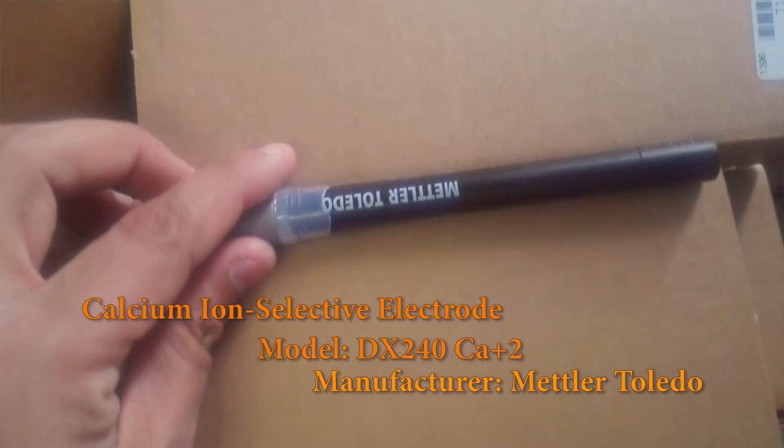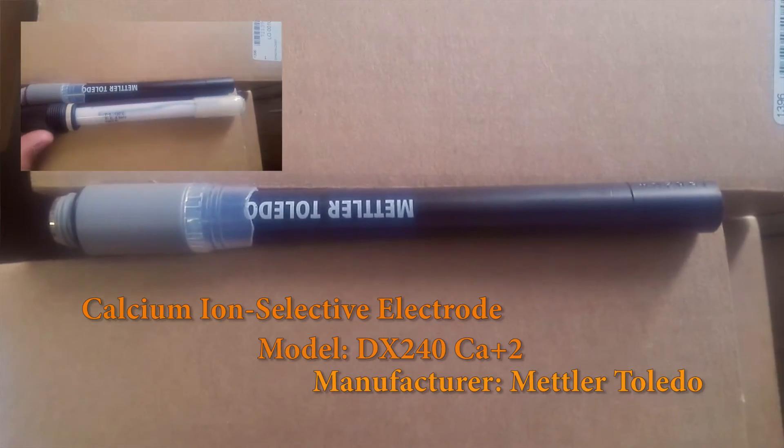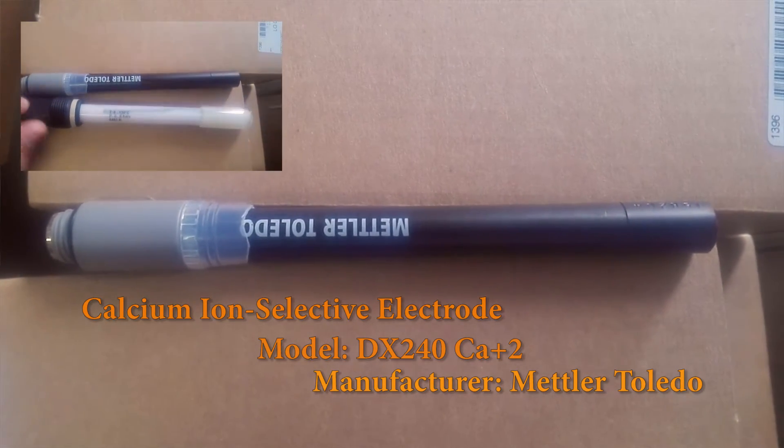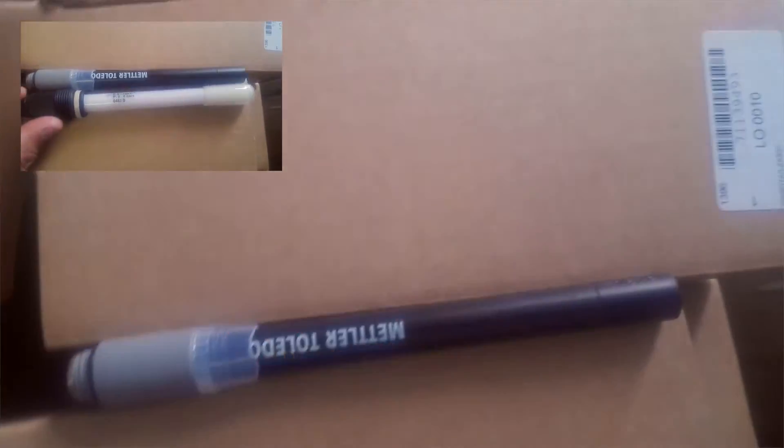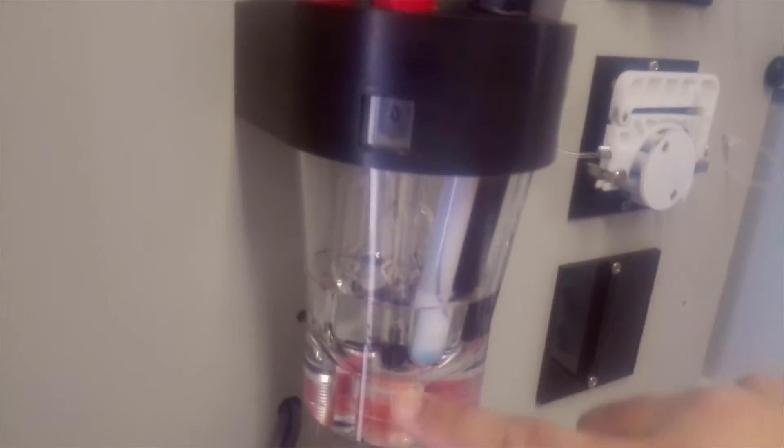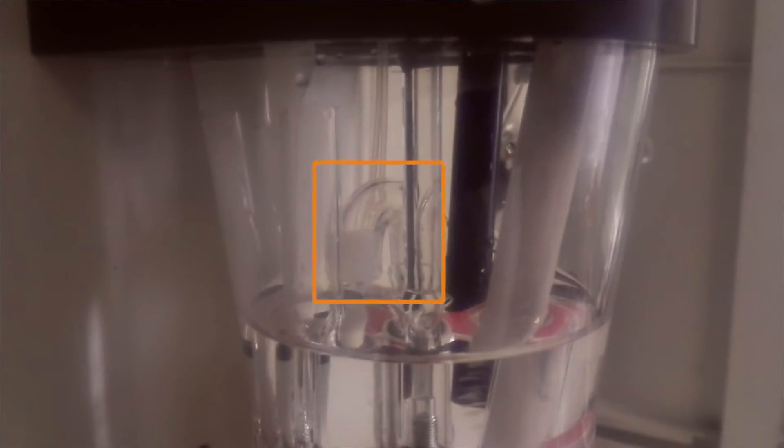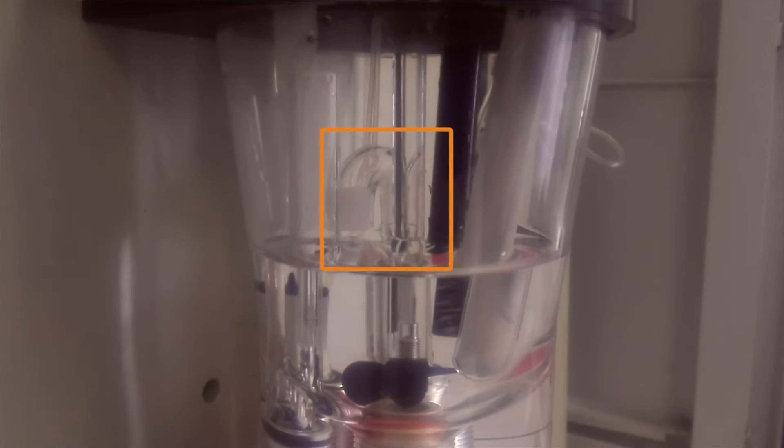The second electrode is a calcium ion selective electrode manufactured by Mettler Toledo, model DX240. This is the sprinkler to rinse the reactor chamber and both electrodes before and after analysis. You can use demineralized water or deionized water for this purpose. On the back side of the reactor chamber, this is the overflow tube. Beside the overflow tube, this is the siphon tube.